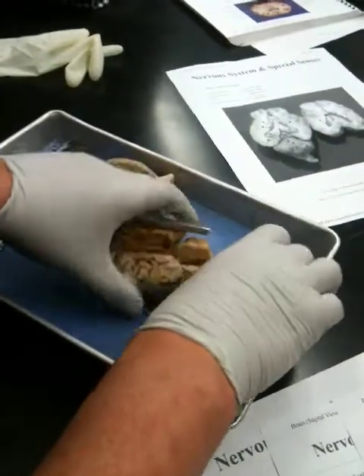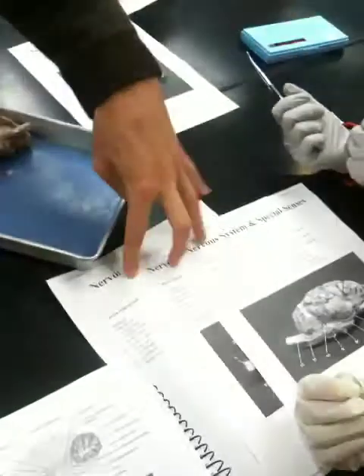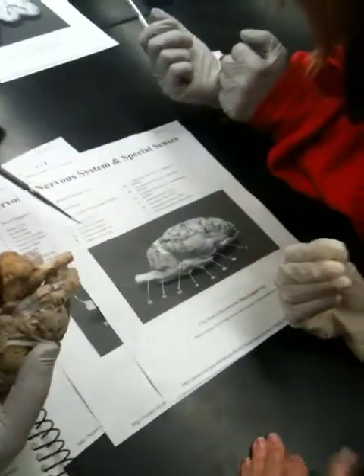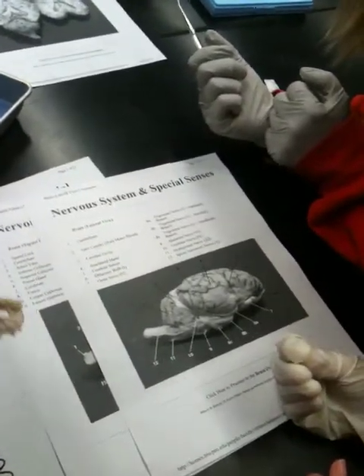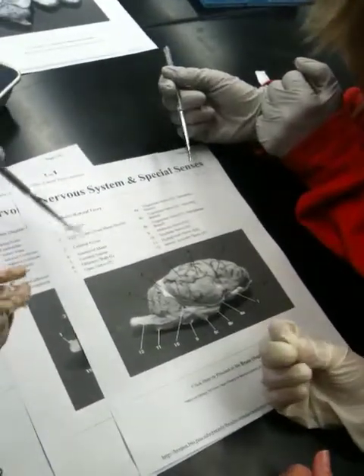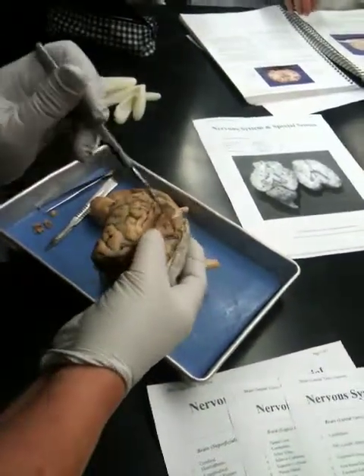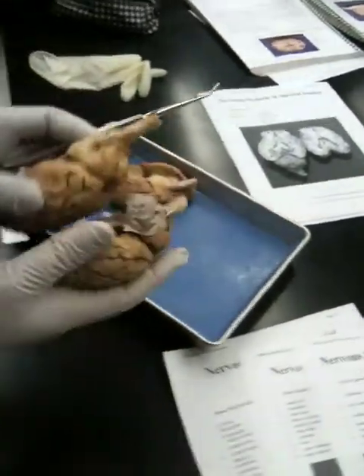I might have missed some stuff, but you can figure it out from how I did it. Is there anything we don't need to know? Some of the nerves you don't need. You just need to know cranial nerve one — I don't care about the bulb; the tract ends in the bulb. And the falx cerebri — that's just the invagination of the dura mater, so there's the falx cerebri. It just invaginates it.